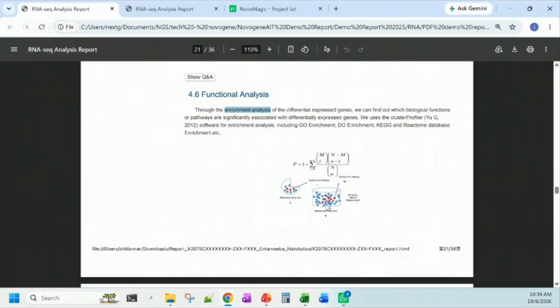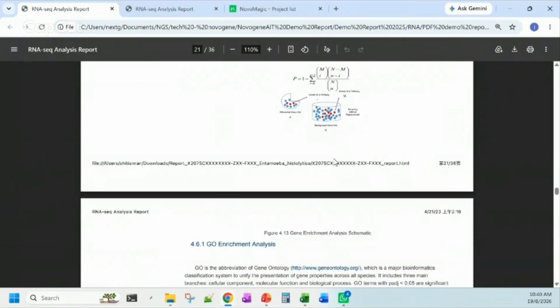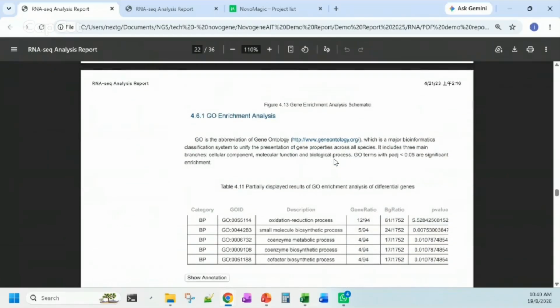But out of the 10,000 genes that we study, only perhaps a very small percentage are involved in glycolysis, but in our differentially expressed genes, we are seeing a lot of genes involved in glycolysis. Then this is called an enrichment. So we can tell glycolysis is something involved in the conditions. So based on these principles, the analysis can be carried out for different functional annotation terms.